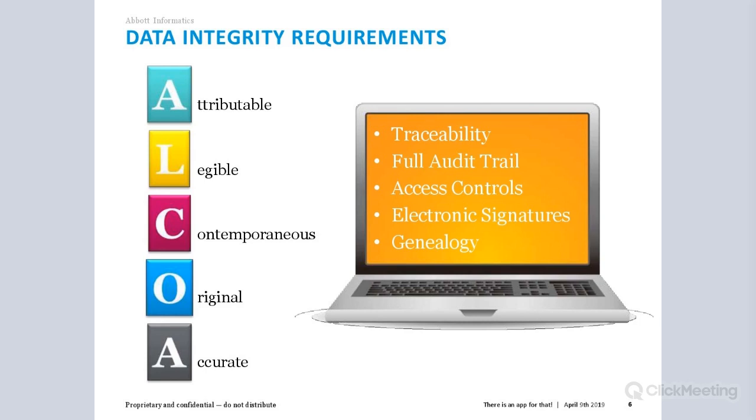Contemporaneous, that might be a tough word to say, but it simply means was the result recorded at the exact time of capture. Using a LIMS is the only way to guarantee this requirement. All testing that is performed in LIMS will have a date timestamp attached to the record by turning on the audit trail.